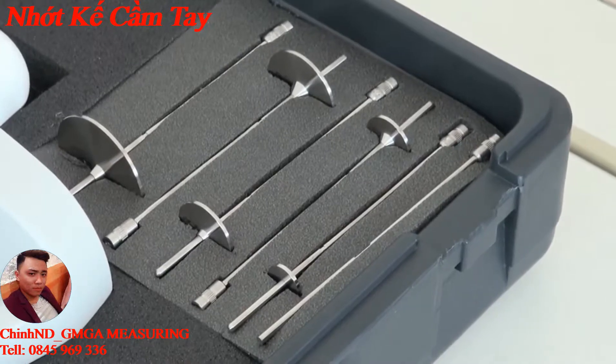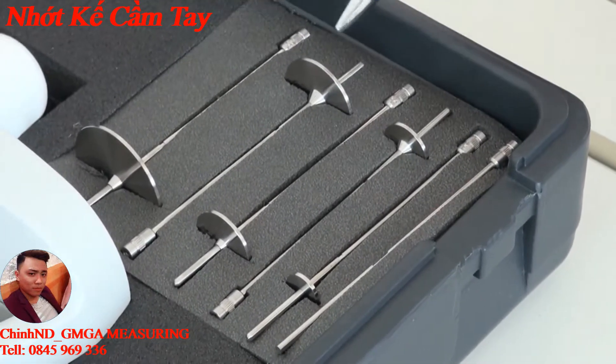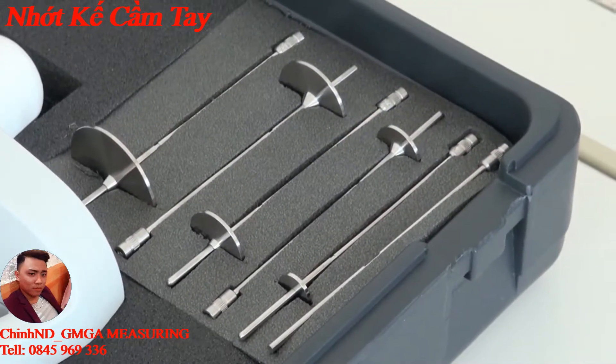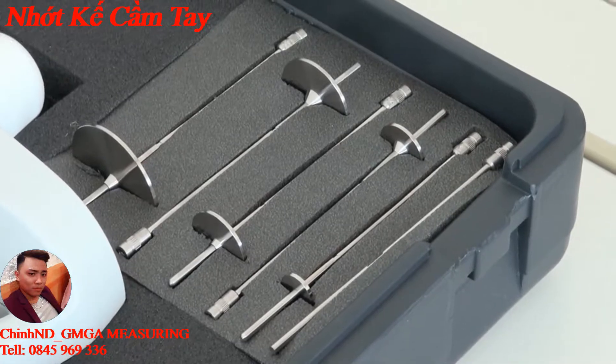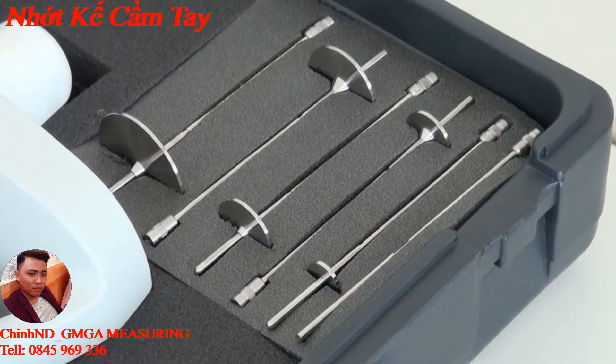The set consists of six rotation bodies — five of them are in the shape of discs and one is in cylindrical shape. Optionally, a further rotation body is available which can cover the lower measuring area.